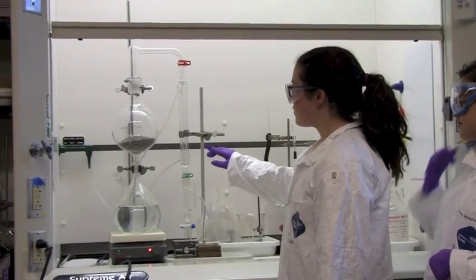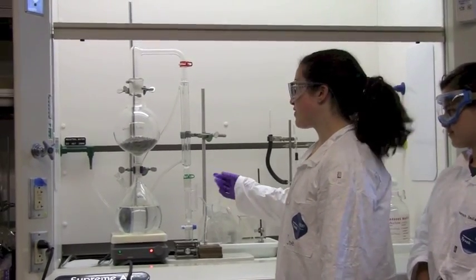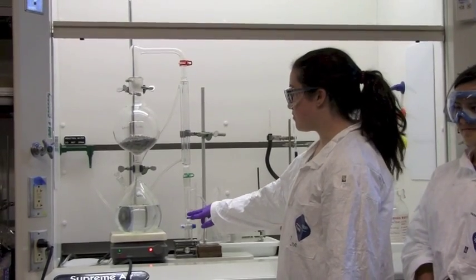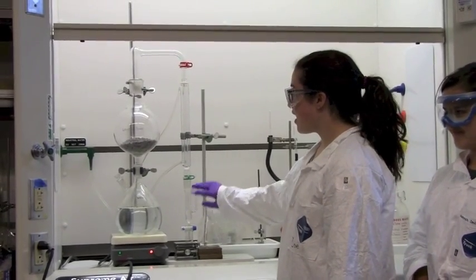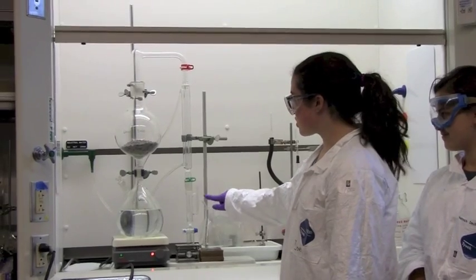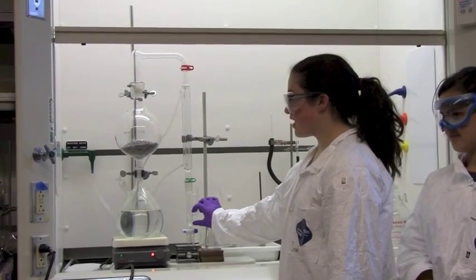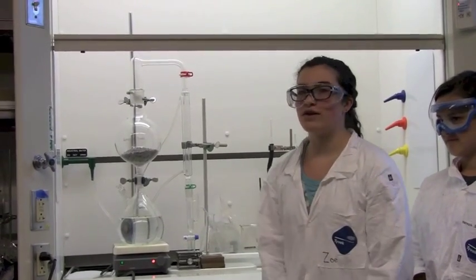So what happens is an oil will be formed from the lavender, and because the density is lighter than water, it will sit on top and all the water that comes down will just go into this Erlenmeyer flask. And once we're done, we can just remove the last bit of water and just have the oil left.